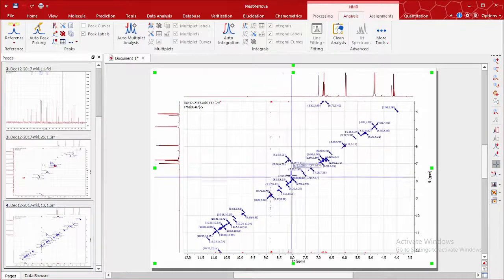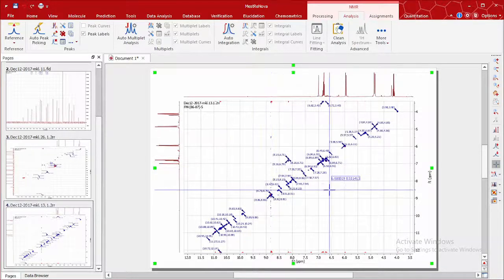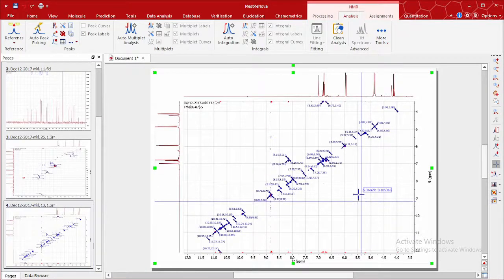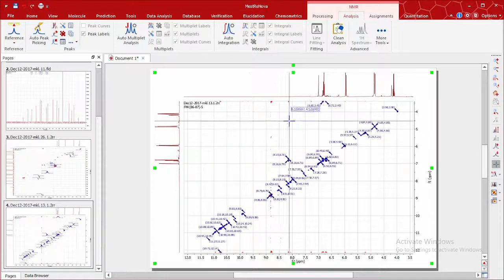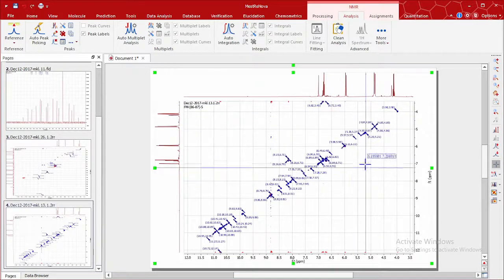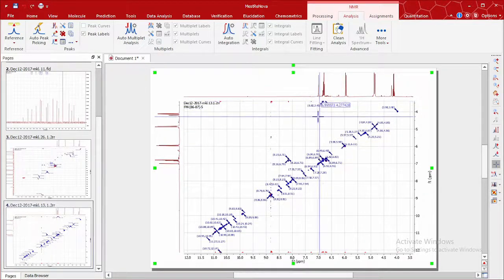Alternatively, you can do it manually, whereby you look for the J value. The J value can also tell you which proton is correlated to another proton. You have an ortho correlation, for example, in a benzene molecule. It means the protons are side by side. When a particular proton is seeing another proton in a COSY, it means the protons are side by side, and you can also confirm this by calculating the J value.